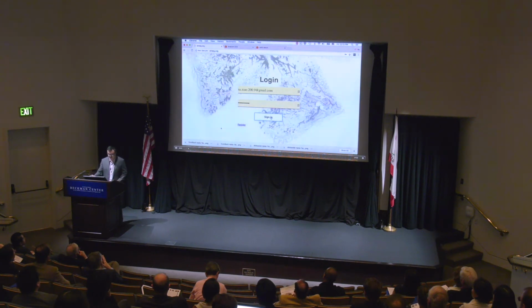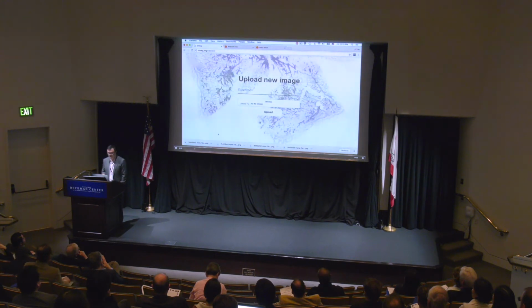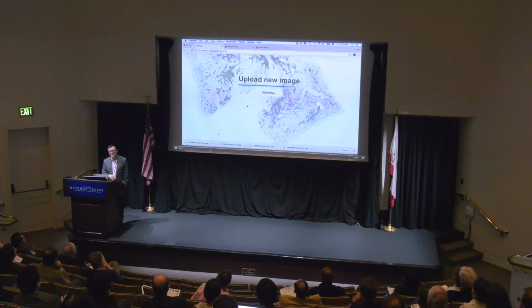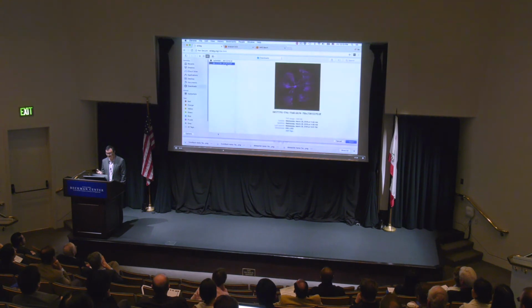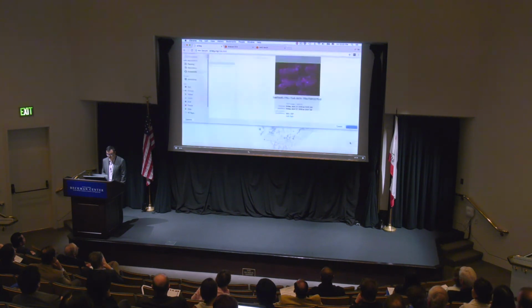So I'm demoing the website here, and what we're doing is uploading these different images to the website. What's kind of neat about this is that these images are from totally different labs from all around the world. They were not part of Marty Friedlander's lab or other labs. These were labs that had started to use this website. And so you can see that already the images look very different than the images I had shown you in the previous slide. I'm just going to skip ahead here in the interest of time.